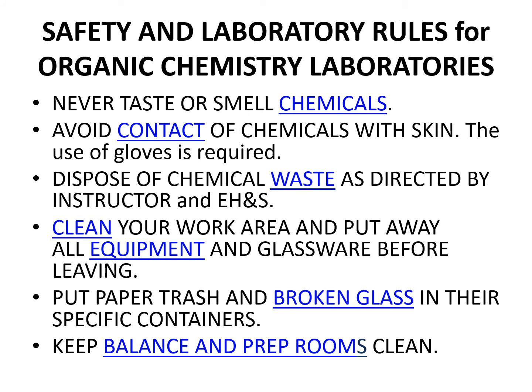Of course, it shouldn't need to be said, but never taste or smell any chemicals. If you do need to catch a smell of something for a specific reaction or something like that, you always hold the container away from your face in a fume hood and do a wafting motion with your hand to bring some of the smell near you, but never put your nose near an opening to a flask and smell it. That's bad. No one wants cancer.